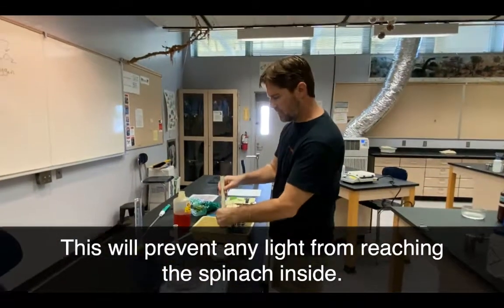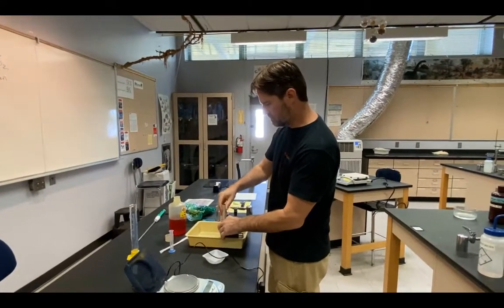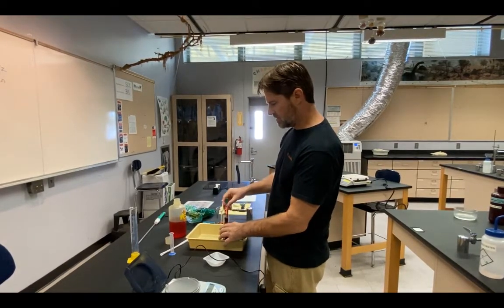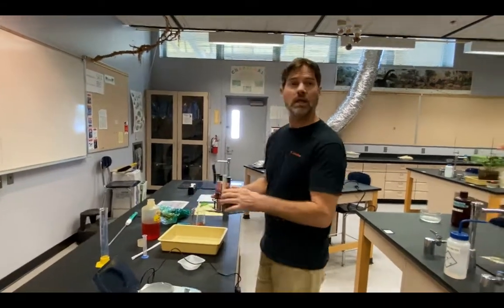I'm going to move all of my tubes towards the front end of my test tube holder to make sure they get good access to sunlight. And I'm ready to place these out in the sun for an hour so we can come back in an hour and see what our results are.